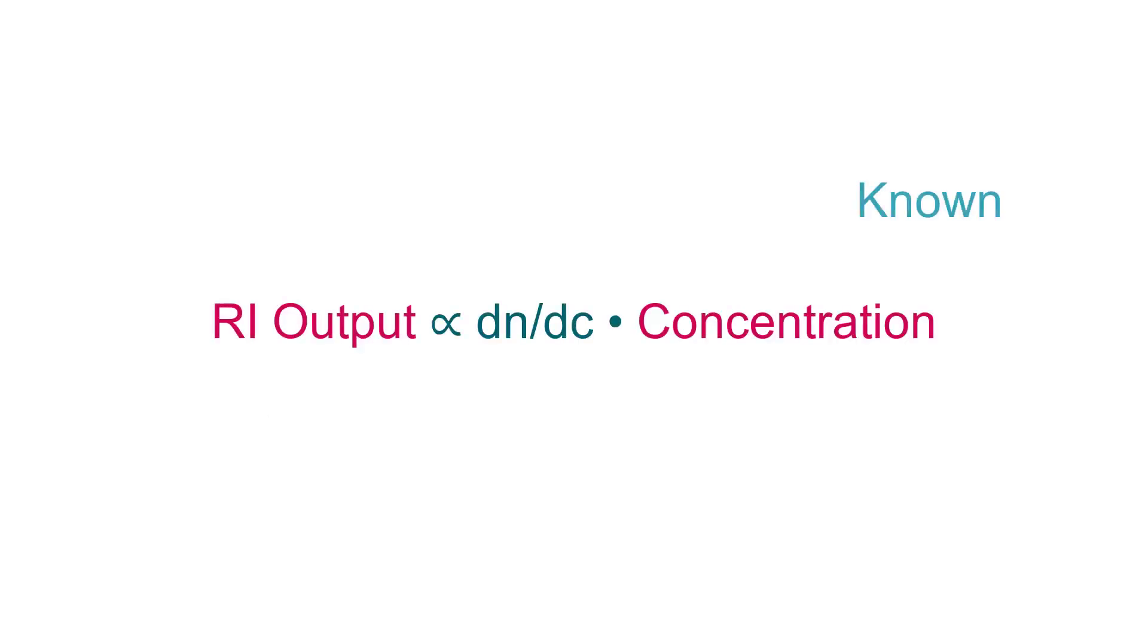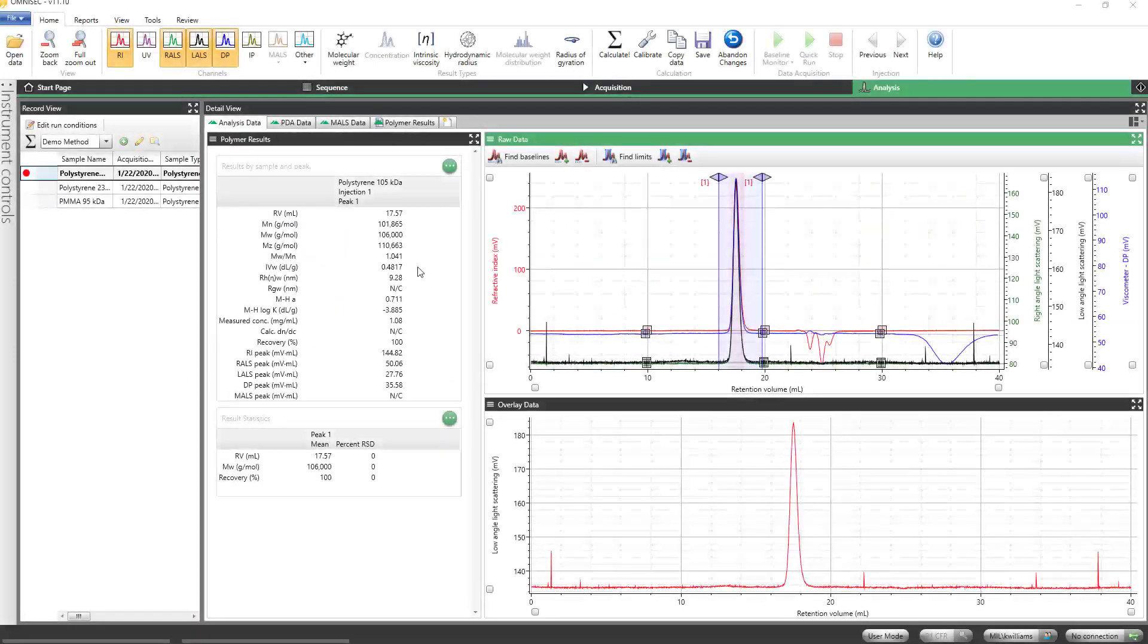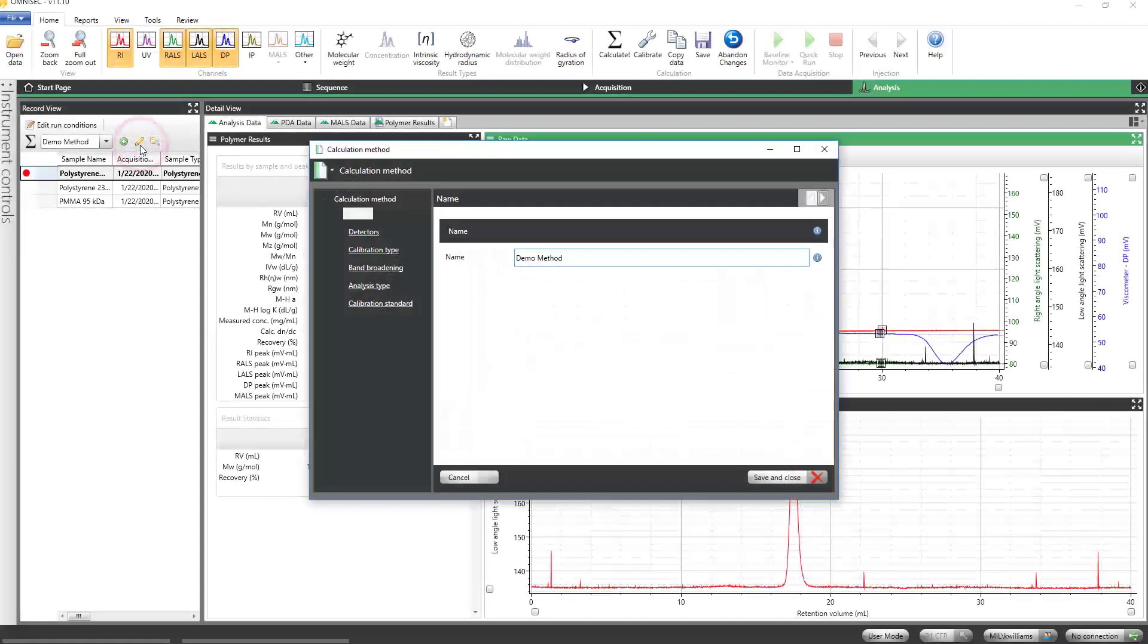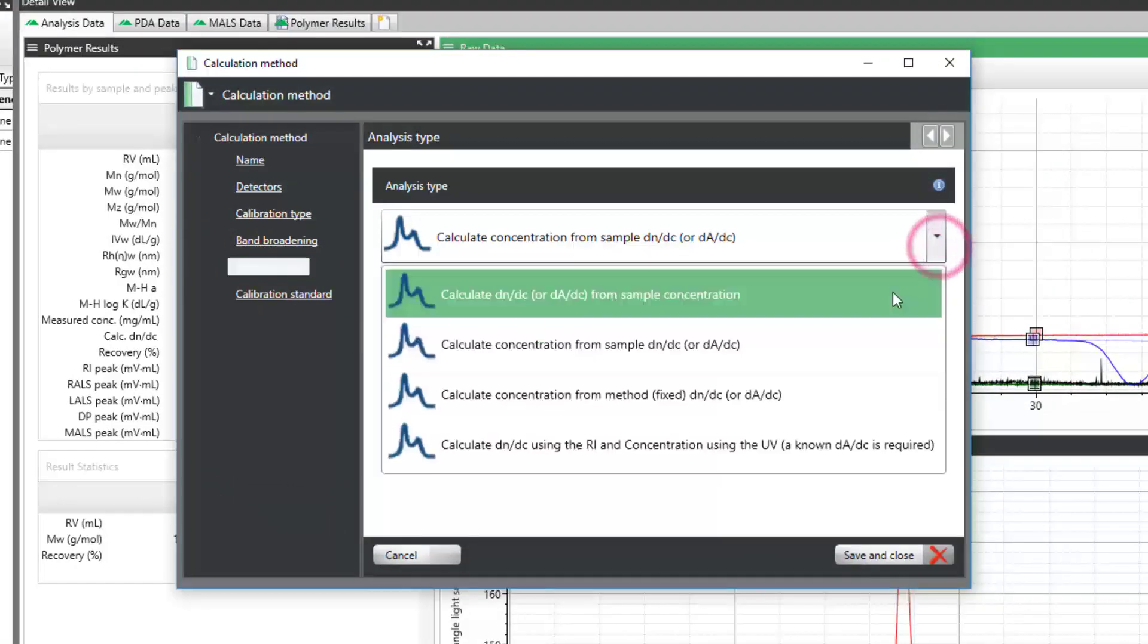If you know the exact concentration of your sample and are confident that your limits and baselines represent the entirety of your completely dissolved sample, the software can determine its DNDC value. To do this, open the Calculation Method window and select the Analysis Type page. Click the drop-down menu and select Calculate DNDC from Sample Concentration.